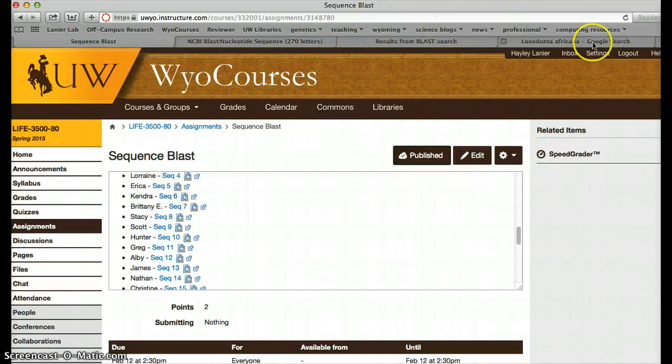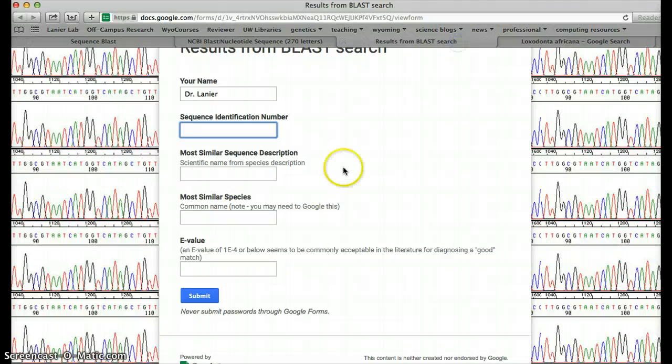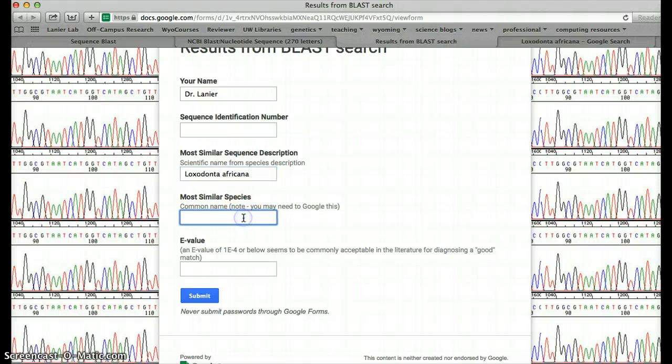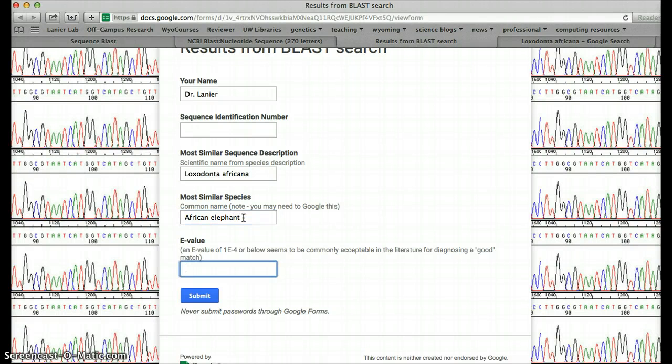In this case, I don't have one. The most similar sequence description. Just give me the scientific name. So that will be what you Googled. Most similar species. African elephant.